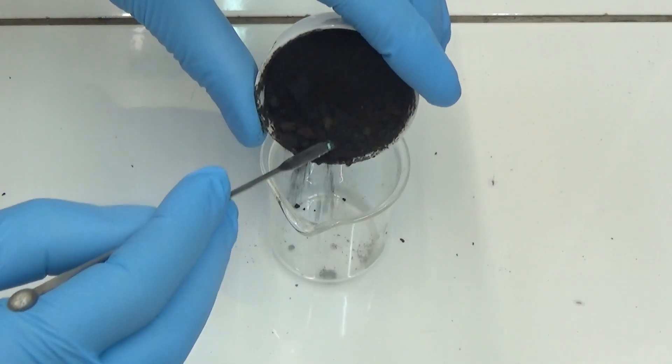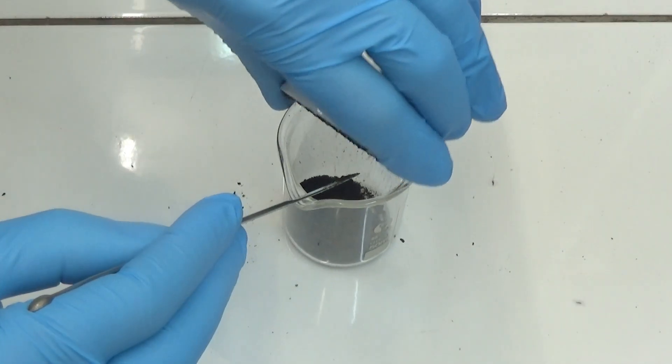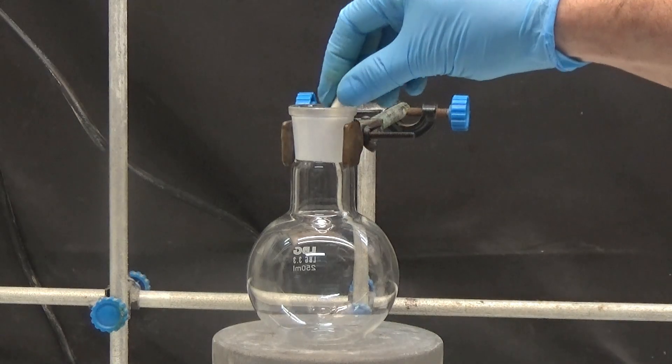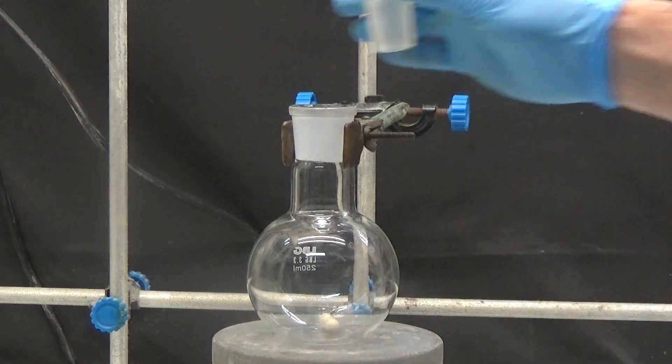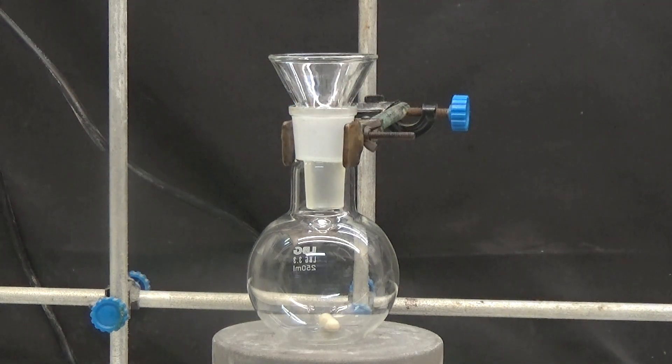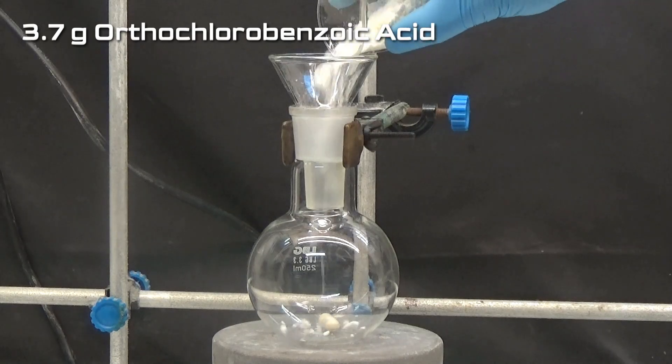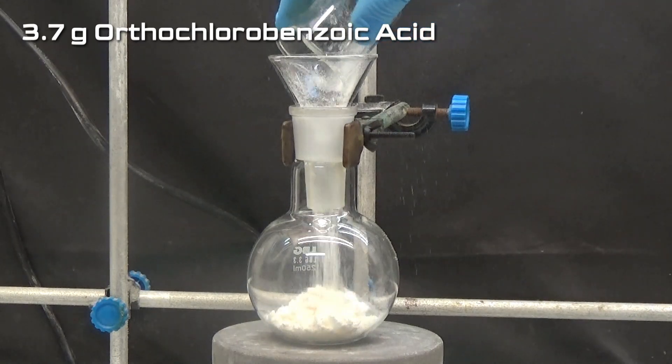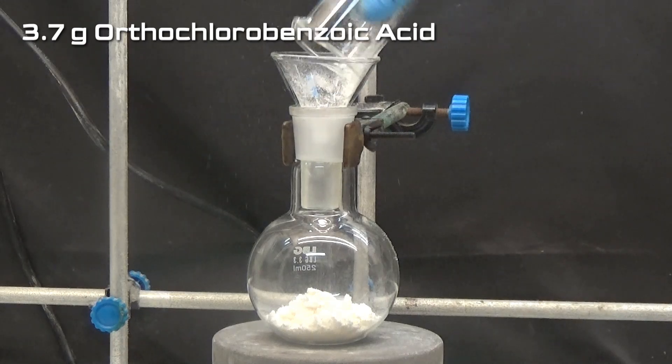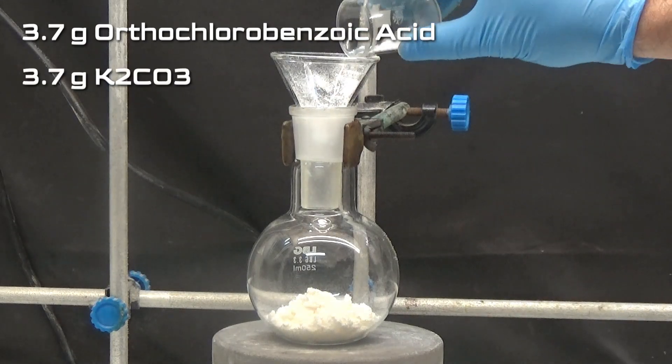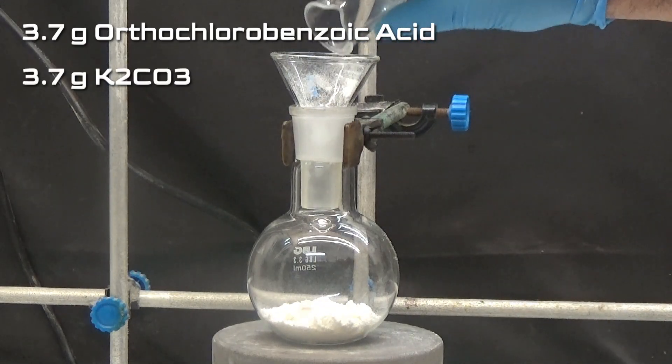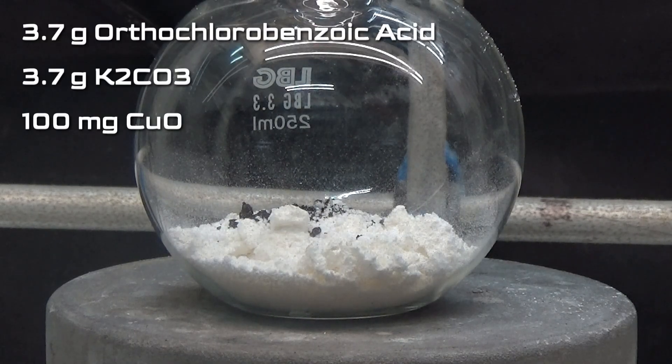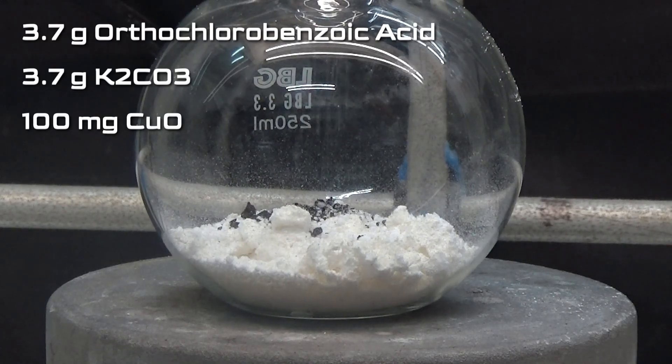We reserve the obtained product for the following reaction. To obtain the phenylanthranilic acid with the Ullman reaction, we are going to put in a flask of 250 milliliters: 3.7 grams of orthochlorobenzoic acid, 3.7 grams of anhydrous potassium carbonate, 100 milligrams of copper oxide, and 14 grams of aniline.